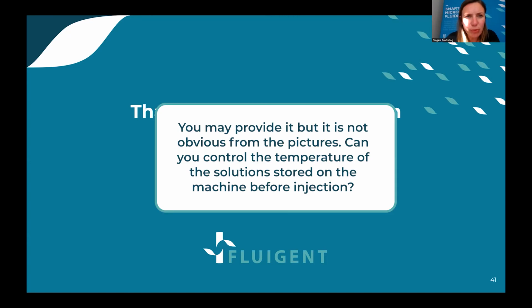Sorry, so you may provide it, but it is not obvious from the pictures. Can you control the temperature of the solution stored on the machine before injection? So this is a good question. I don't know if William wants to answer. I think I can answer.